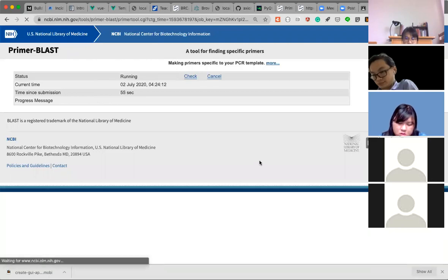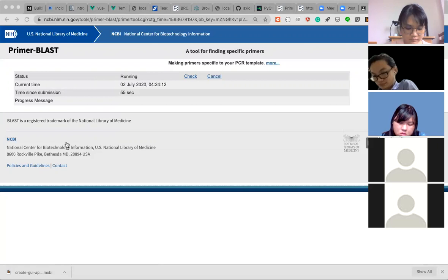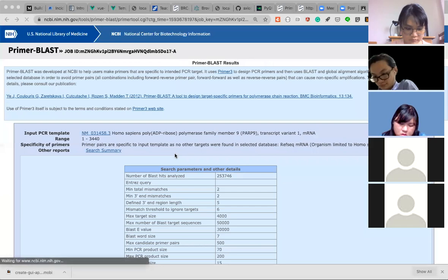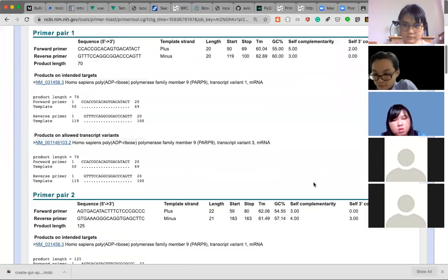Have to wait a minute. Okay, I think the result is in.